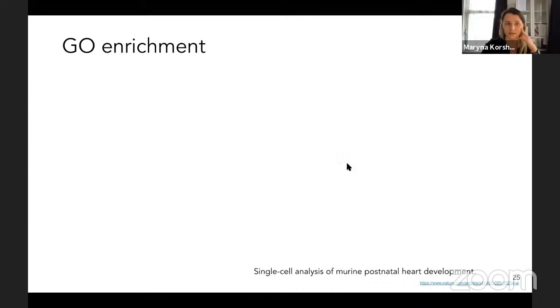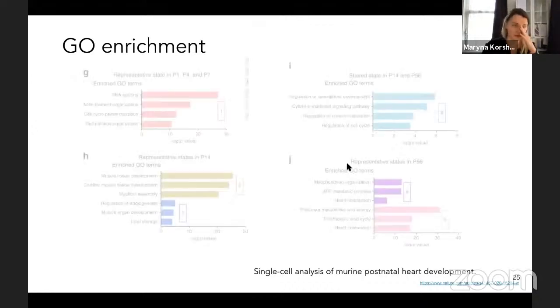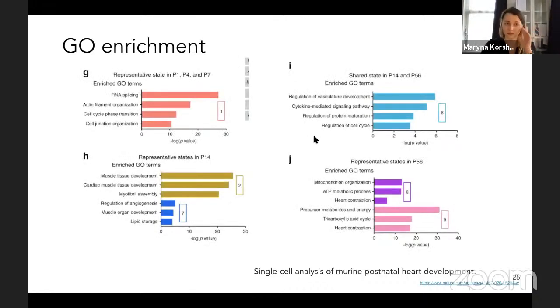And as was used in pseudotime already, enrichment on gene ontology terms. So what does it do? The gene enrichment takes the genes of interest which you can observe in one cell type or group of cell types, and assigns them to particular biological processes which were already discovered.